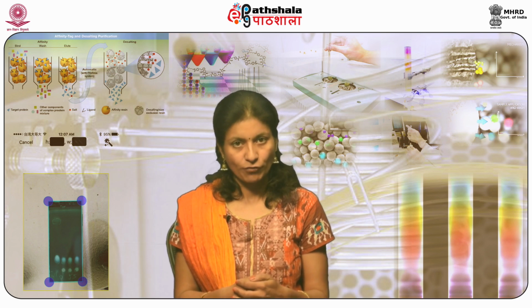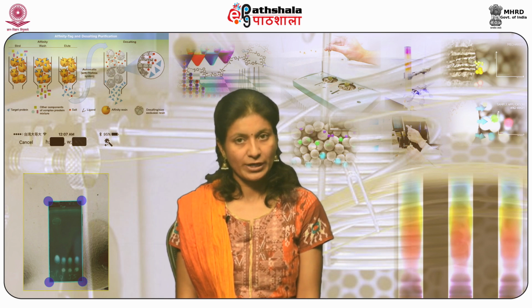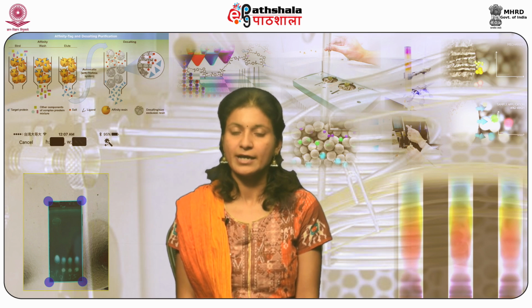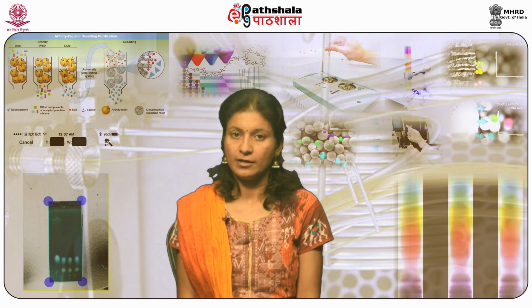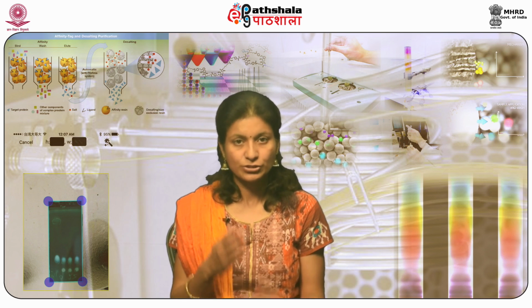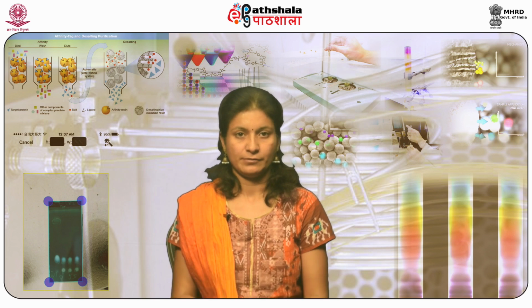It consists of a flowing mobile phase, that is, generally inert gases like helium, argon, nitrogen, etc., an injection port which consists of a rubber septum through which a syringe needle is inserted to inject the sample.